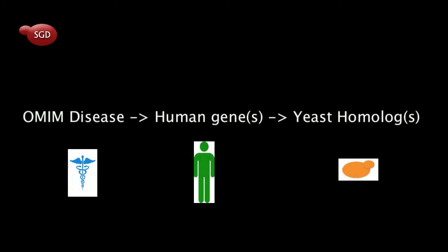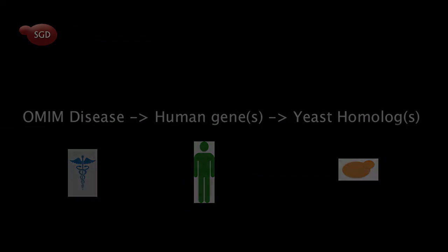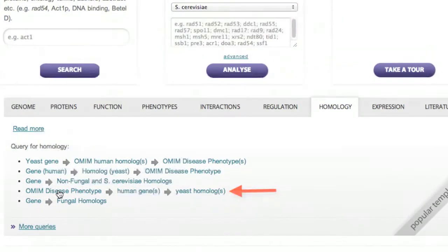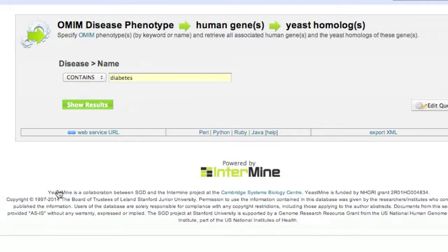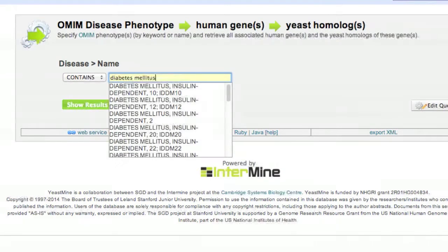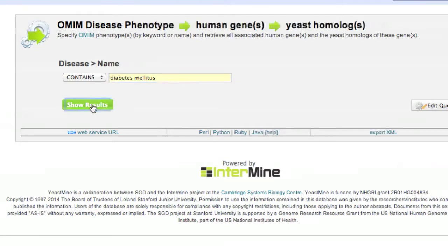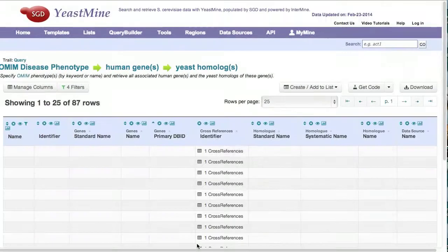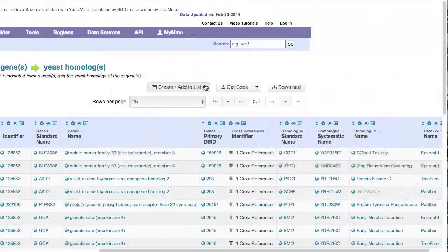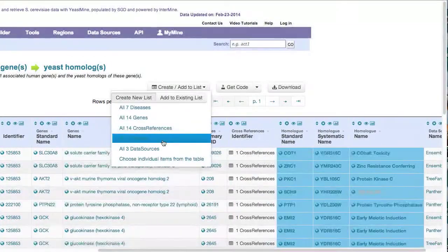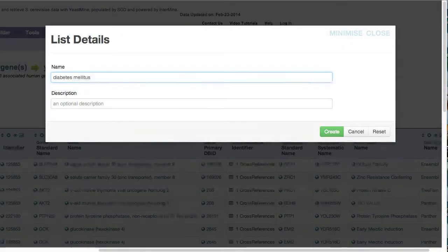The template OMIM disease phenotype to human genes to yeast homologs lets you begin with either a disease keyword or specific OMIM phenotype and retrieve the associated human genes and their counterparts. For instance, you could search for the keyword diabetes, an exact term or your own phrase. You will then retrieve a list of human genes and their potentially interesting yeast counterparts. Create a list of your desired yeast genes and save them as a list for further analysis using other templates.